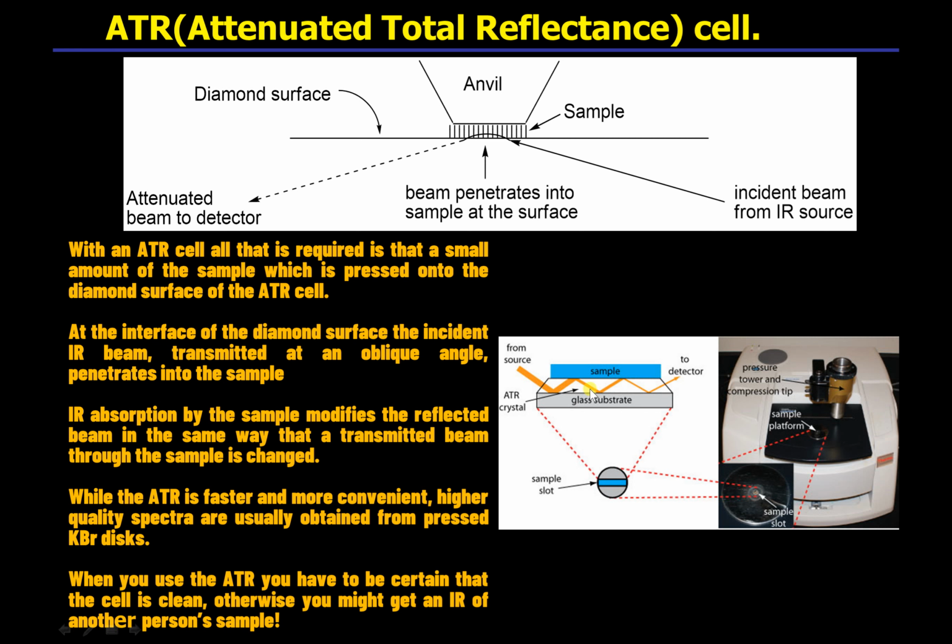So here you put it here. This is the sample, and this is the ATR crystal, and in between, this goes through this thin slit, and the incident radiation was much more. The sample absorbs, so some percentage is transmitted.